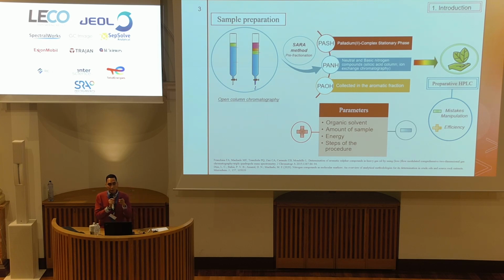To perform all of this methodology, we need too much organic solvent and a big amount of sample, but especially there are too many steps in this procedure, which can reduce the recoveries that we obtain when we perform these kinds of methodologies.